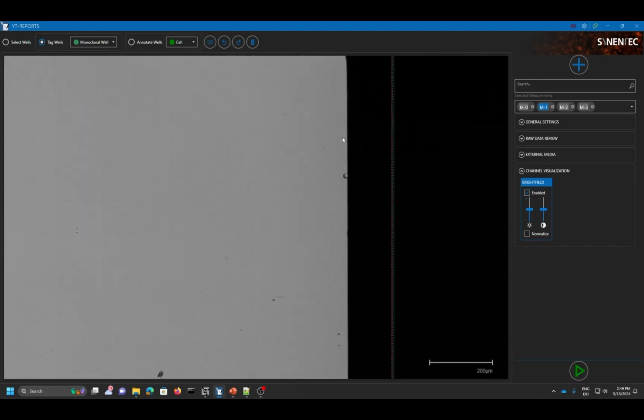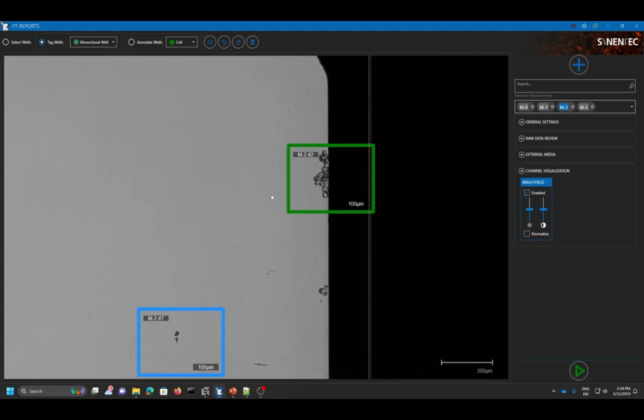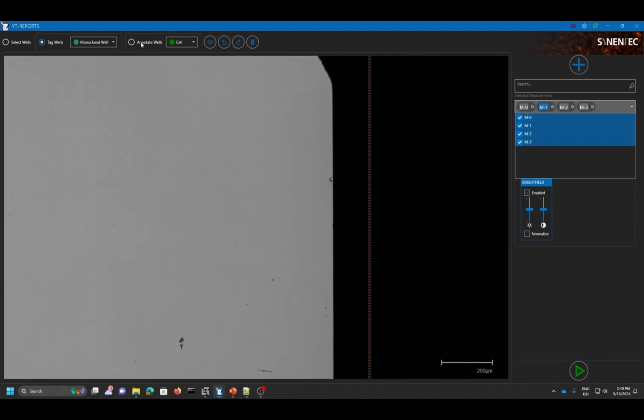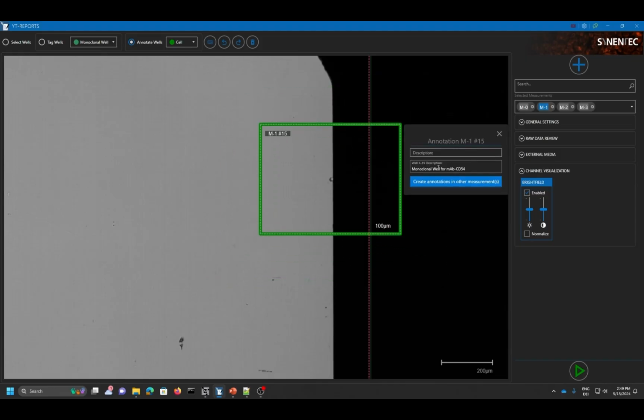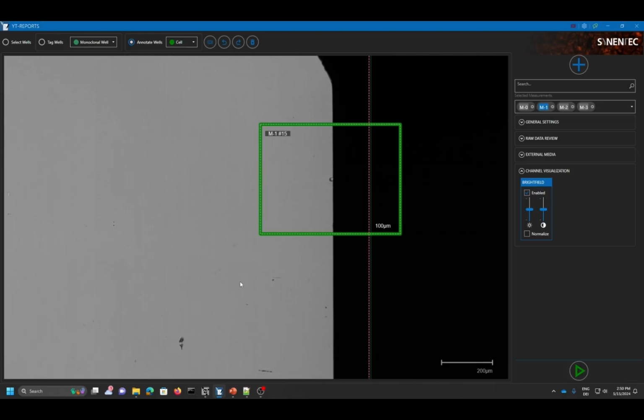And after all of this is taken care of, I can zoom into the single cell well, find the single cell, also check if it really outgrew into a colony or not, and can go into the annotation section, select the annotation type cell, hold Control, and also change the annotation size if I want to, and click to create the annotation for this very well. I can just call it single cell and keep it like this.